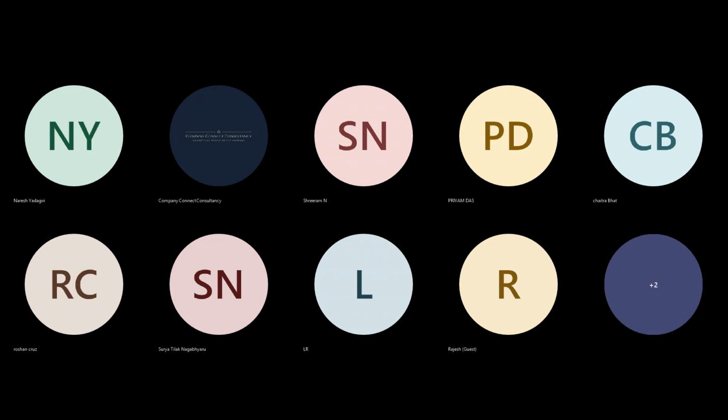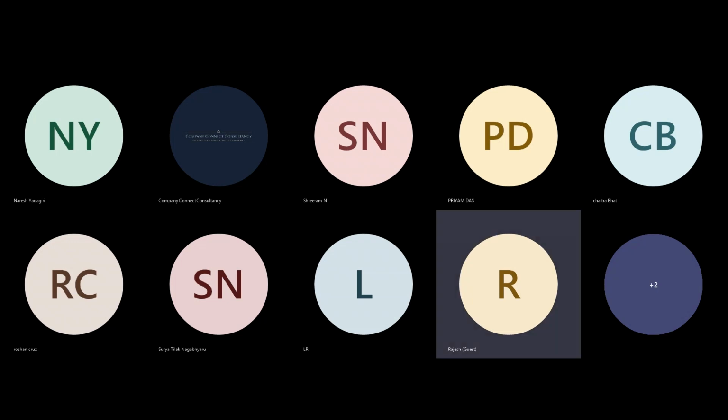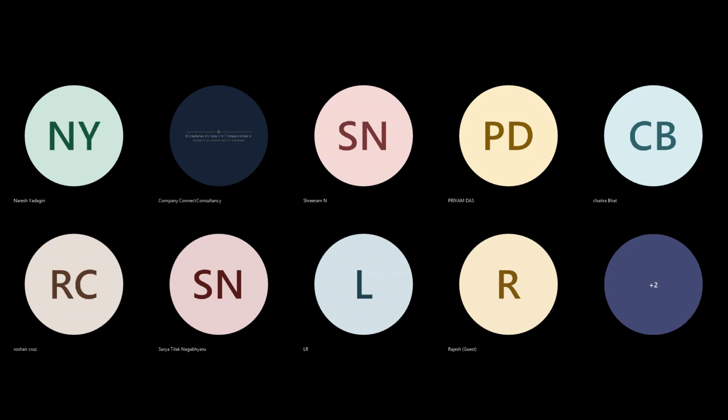But yes, the materials which we have, what we'll teach you, those will be enough for you to understand what you need to do. It will give you a good understanding of LabWare LIMS. I'm 100% sure about that.